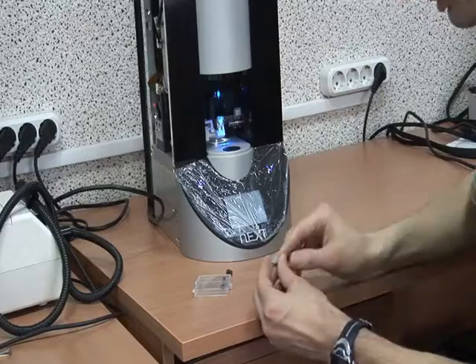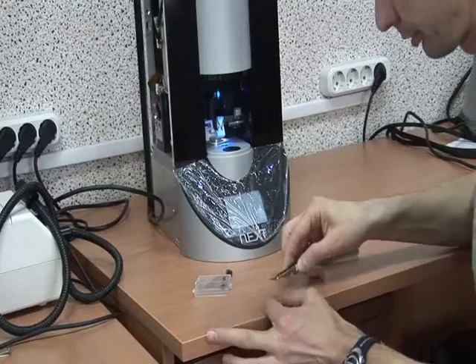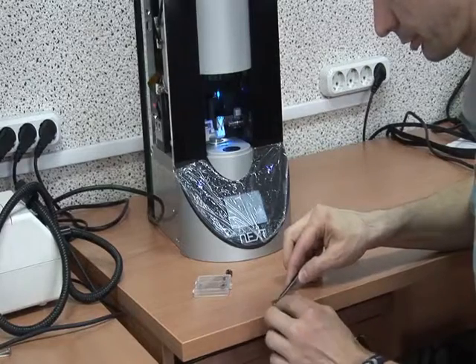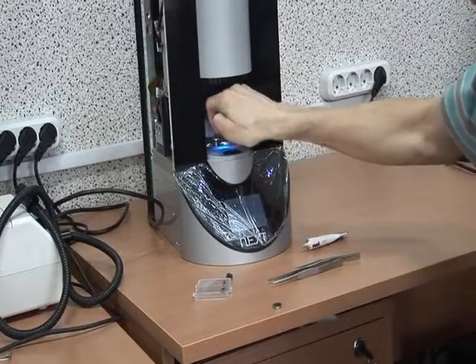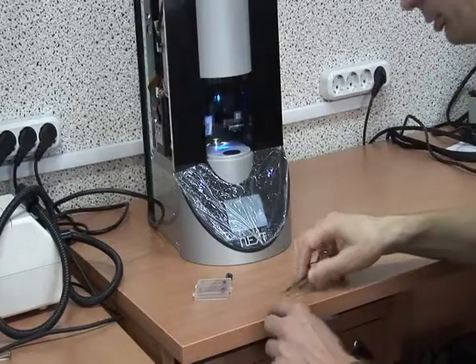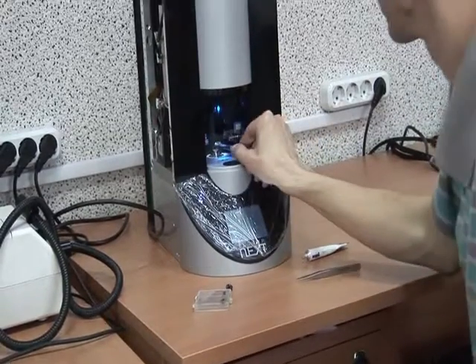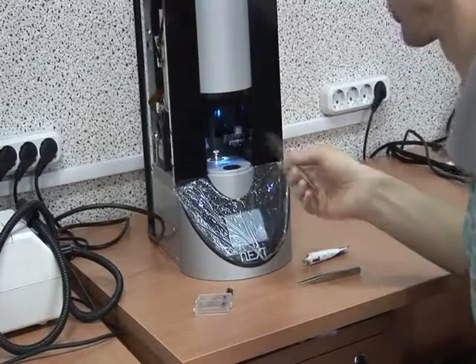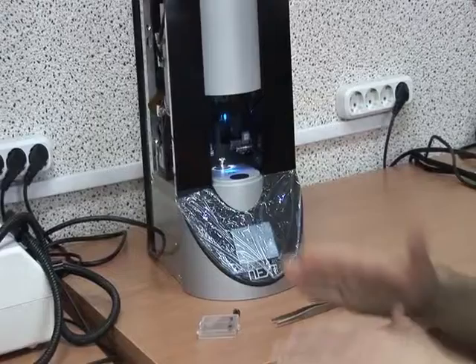I make a small drop of the glue and fix the graphite. I'm mounting the sample. Usually we have to wait some time until the glue fixes the sample strongly.